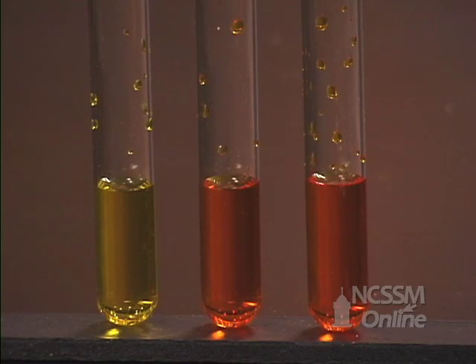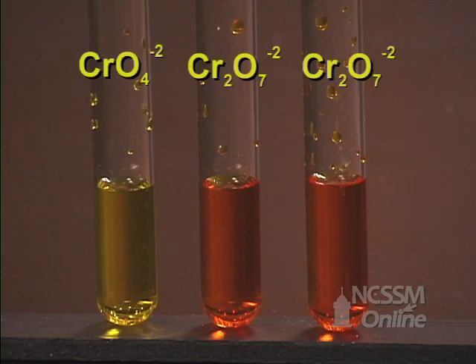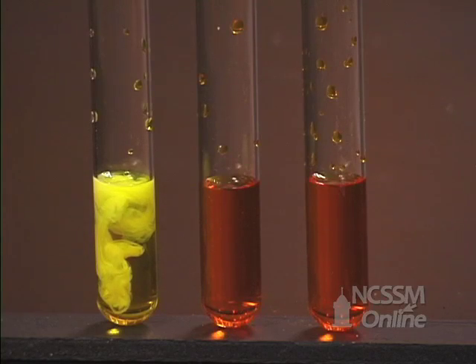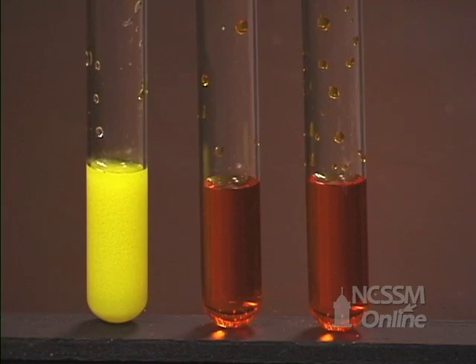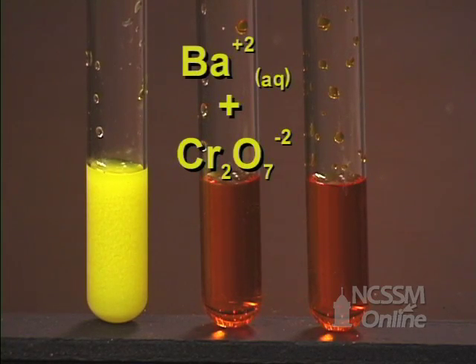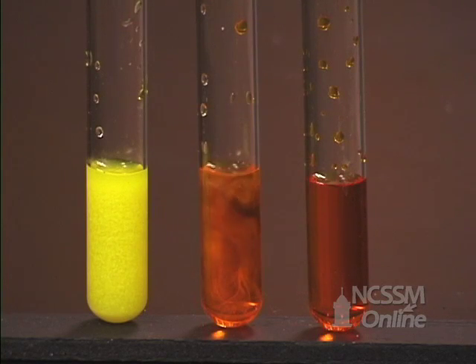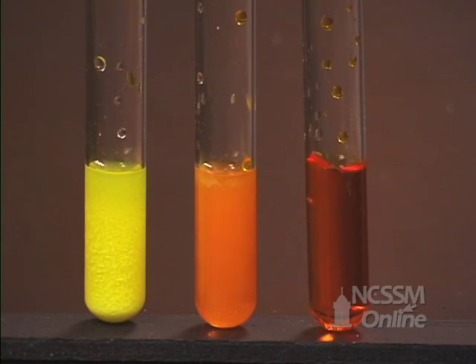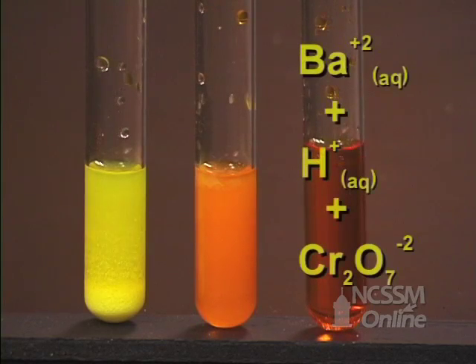We have three test tubes: one containing a solution of potassium chromate and two test tubes containing solutions of potassium dichromate. We are going to add a solution of 0.1 molar barium chloride to the first tube. We are going to add a solution of barium chloride to the second tube. To the third tube, we are going to add some nitric acid first, and then we are going to add barium chloride to the solution.